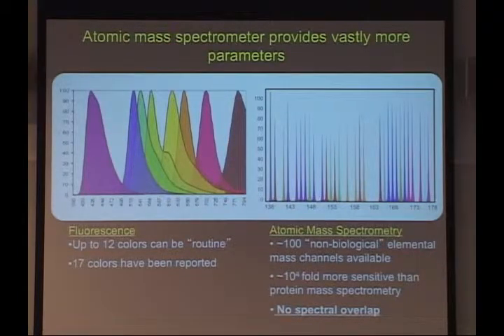It has a large dynamic range. In some aspects of ICP-MS, the dynamic range is almost 10 to the 9. So you can measure from 1 to 1 billion with linearity and quantitation. This technology is not quite there yet, but I'll talk about that in a little bit.